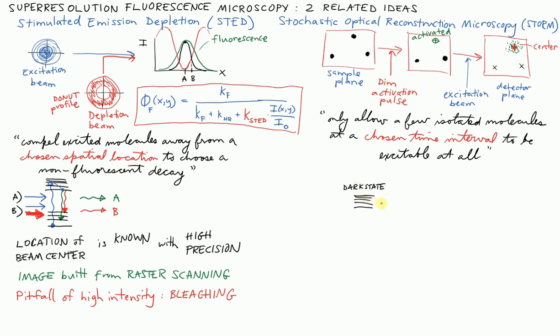It's not necessarily going up or down. I'm going to draw it as a somewhat upward arrow. And you can simply transition to a different configuration of the fluorescent molecule. And for reasons we don't have to get into, and that honestly I can't get you into, it now transitions to being in an excitable state.